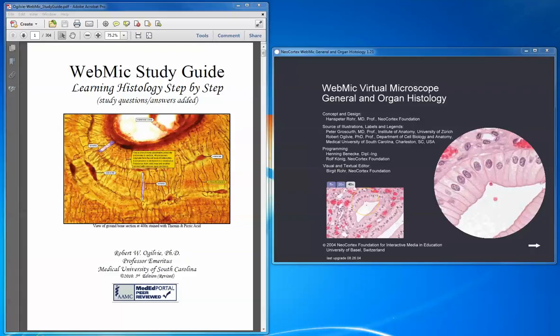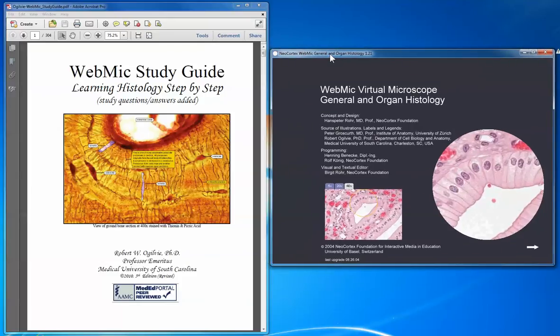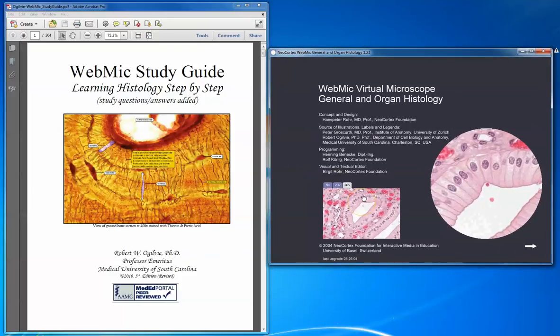The purpose of this video is to orient you to the WebMIC study guide and how it will be used to facilitate your study in WebMIC. Here is the first page of the study guide, which you are required to purchase at the bookstore on the Columbia campus of University of South Carolina. On the right is the WebMIC entry page of the program that hopefully you were able to successfully access and manipulate. This video will show you the relationship between the two.